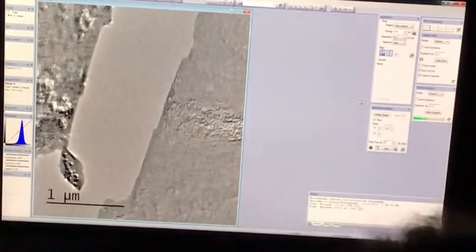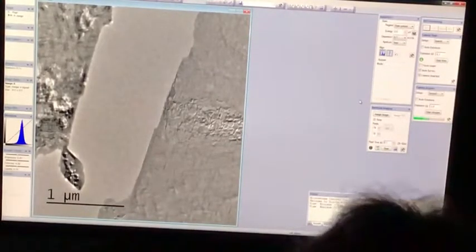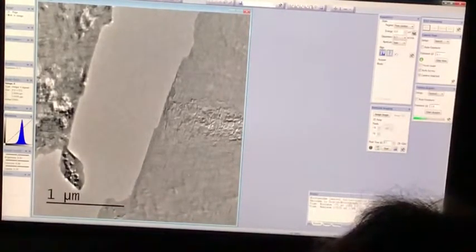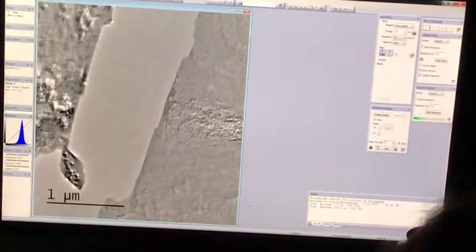So this is how you'd approach doing a consultancy project for somebody. You'd say, okay, well, let's have a look at the specimen, let's get a rough idea. We've looked all around the hole. We found this area here, and we can see these lines in there. Those are probably precipitates, but that's just a guess. Okay, we need to find out and collect evidence for those statements.